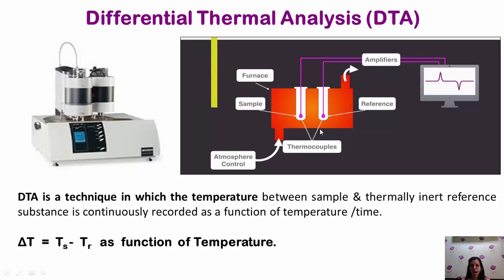We have kept both of them in a furnace. We are applying temperature through the furnace, and through the thermocouple we are going to check the changes in the sample.